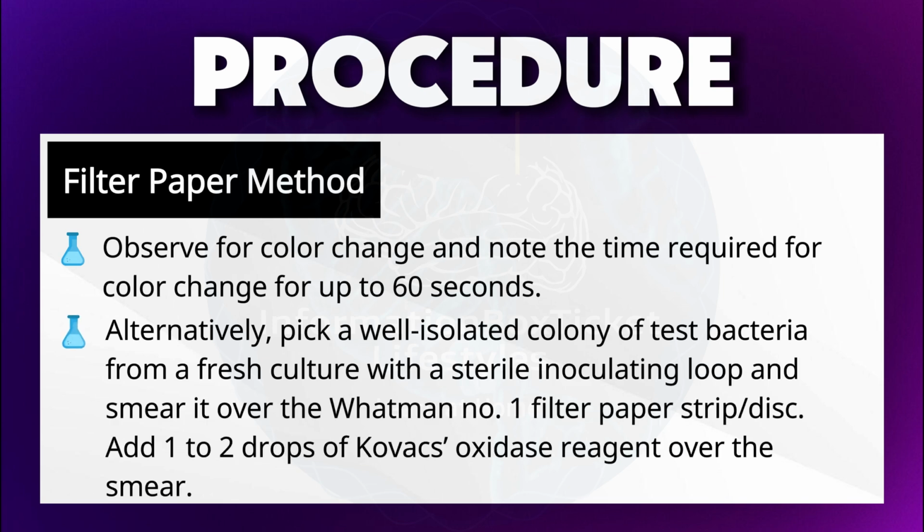Alternatively, pick a well-isolated colony of test bacteria from a fresh culture with a sterile inoculating loop and smear it over the Whatman no.